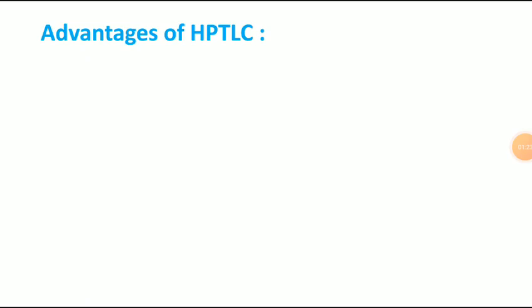Advantages of HPTLC. First one will be no need of internal standard. See, actually in some analysis we are using the internal standard, but in this HPTLC technique we are not using any kind of internal standard.